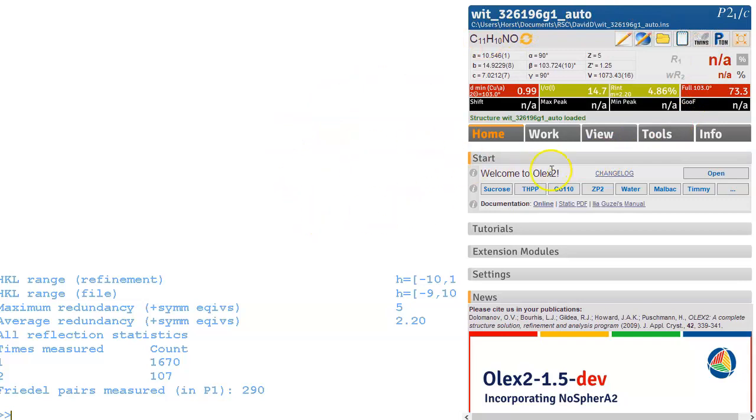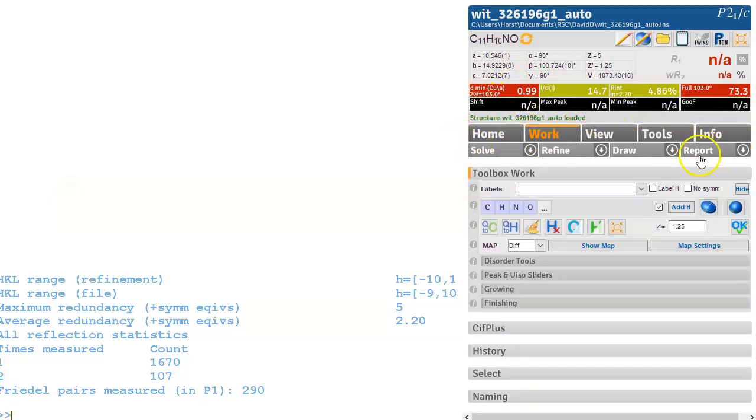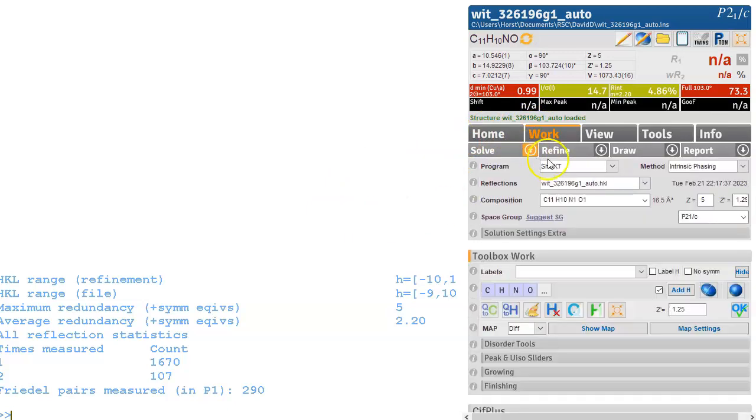So this is the latest dev version of Olex2 and you click on work. So this gives you the area where you can start working on things and the first thing we need to do is solve the structure, solve the phase problem and there's some structure solution programs available. So ShellXT is the one that is highly recommended and you can also use the built-in Olex2. If you don't see any of those other options and just have Olex2 then you need to link some crystallographic software to Olex2. There is some information about how to do this elsewhere.